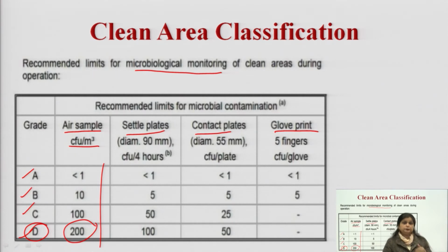And what will happen? After 7 to 14 days, the samples containing microorganisms will form colonies. Colonies will be formed as microorganisms grow, and those colony forming units are counted within the Petri plates. How many colony forming units are there within the Petri plate?